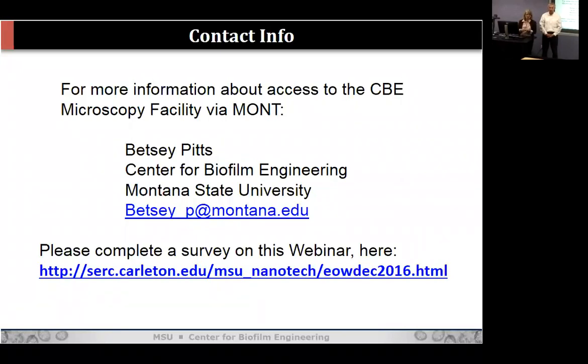Well, the resolution is much lower on those objectives. They're usually on the order of 130 microns, so you can only see 130 microns in. It doesn't include the cover slip, but you can do slices, absolutely, within a couple micron steps all the way. The gel I showed you, those gels are usually 400 microns thick. I can see all the way through them, but I use like a 20x. I go down in magnification, but we do have the whole range. I think we have one that would suit you.